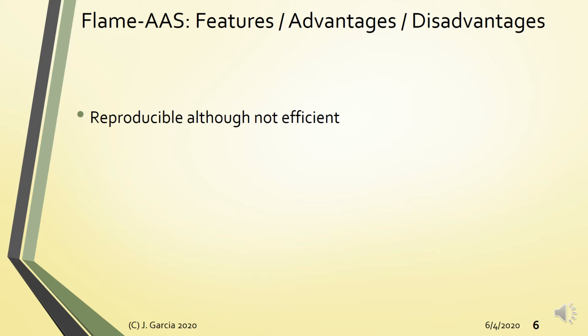Not all of the solution aspirated will end up in the flame. Only less than 10% of the solution goes to the flame, and the rest goes to waste. So it's a bit of a waste of sample. That's one of the disadvantages, but it's very reproducible.